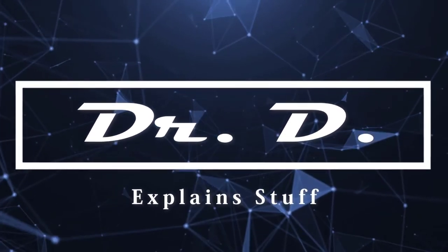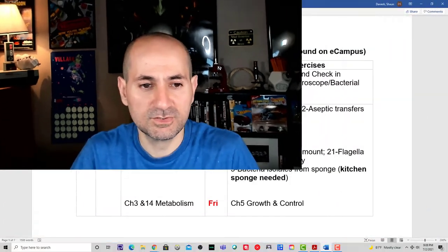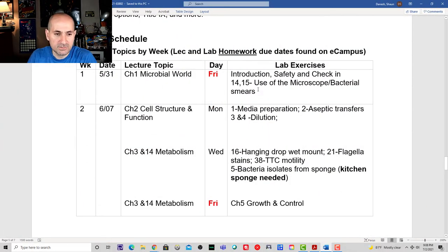Hey everyone, Dr. D here, and in this video we are going to be covering the material for lab practical number one for biology 2421. That's microbiology for science majors. Let's go ahead and get started. On the first day of class, we had introduction, safety, check-in, but let's go to this lab here. Use of the microscope, bacterial smears.